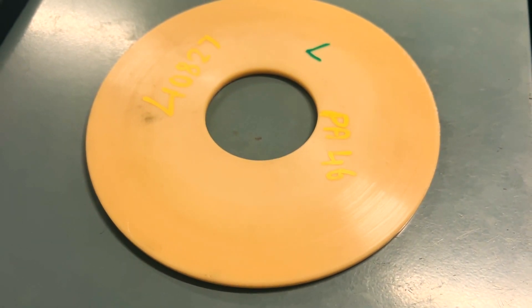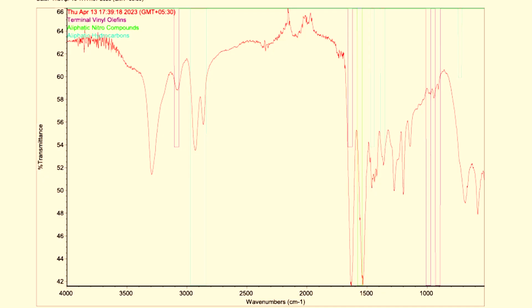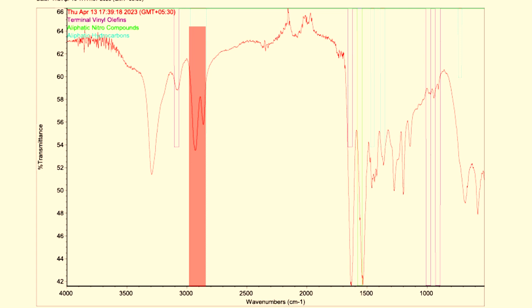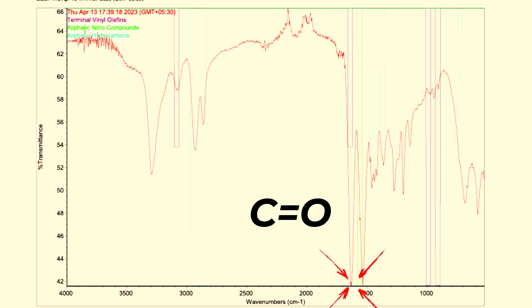The final sample we're looking at is nylon 4-6, which is a straight-chained polyamide. On closer analysis, we see the main presence of aliphatic hydrocarbons due to peaks near 2800 to 3000 per centimeter. Also, a C=O stretch is usually observed at wavenumbers between 1690 to 1630 per centimeter for amides. You don't need to know all these wavenumbers or what aliphatic hydrocarbons are, because the instrument will give you the final result anyway. However, if you want to go deeper into the subject and find out the nuances of different polymers, this knowledge will be useful.